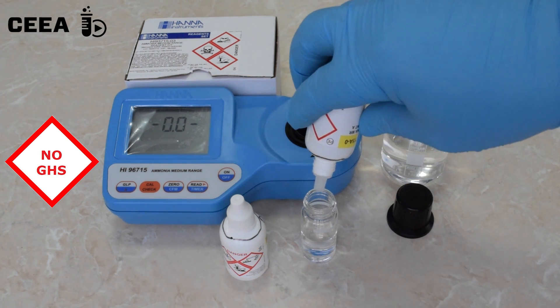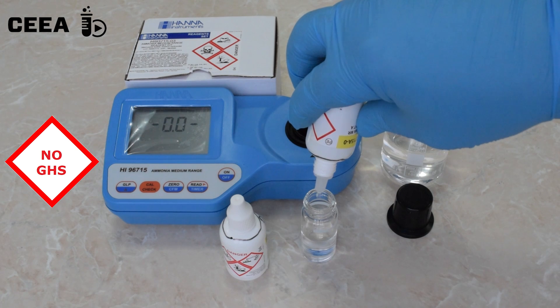The probe is buffered using pre-calibrated reagents.